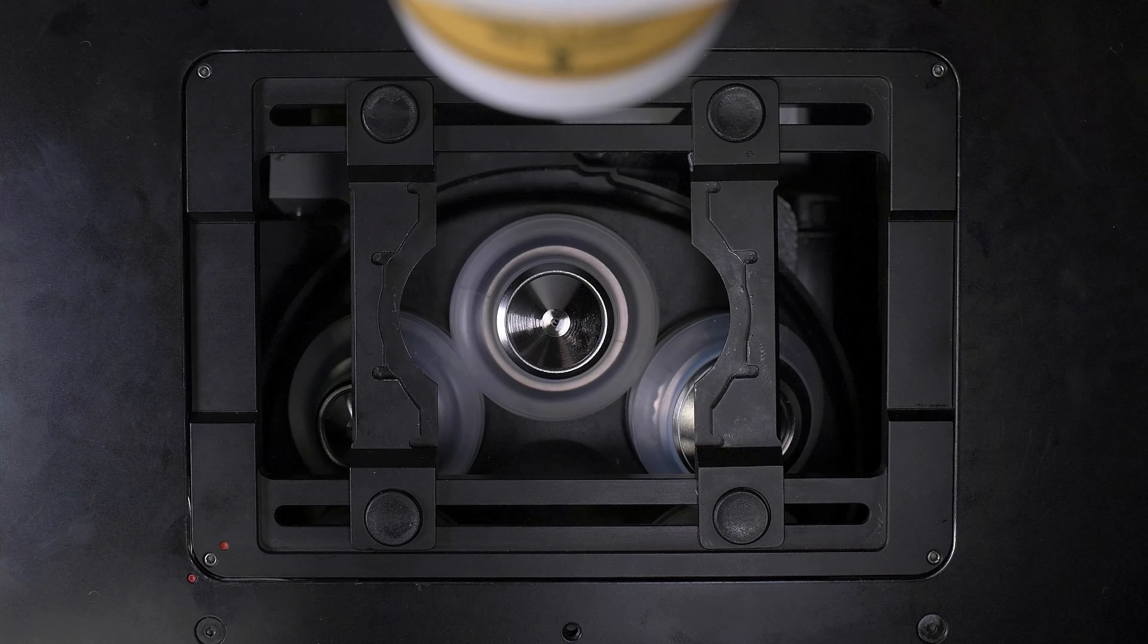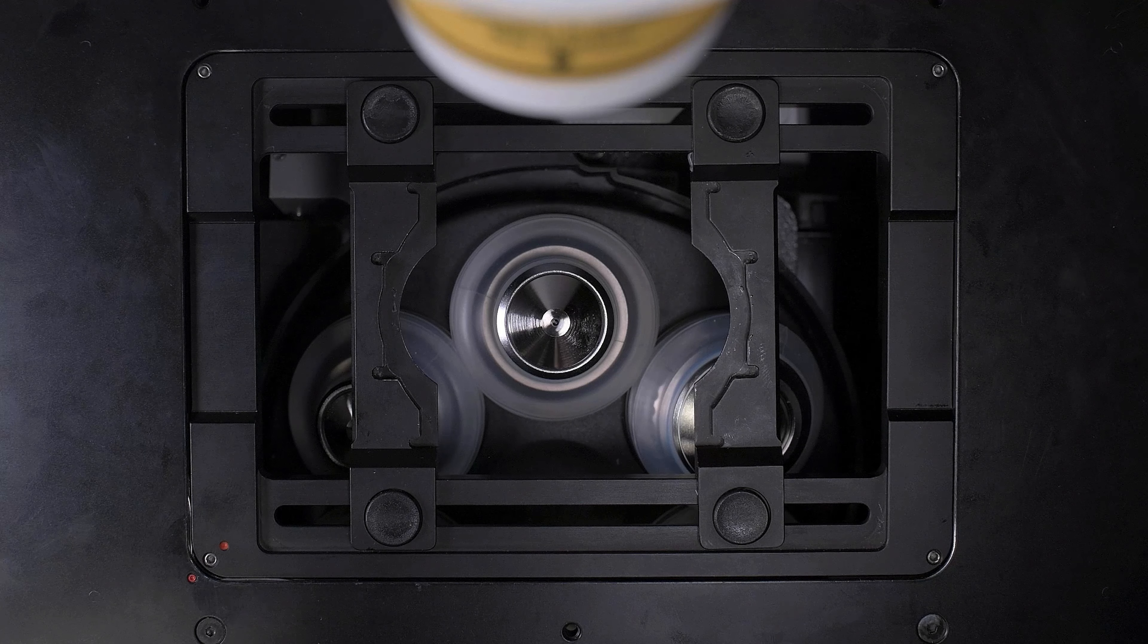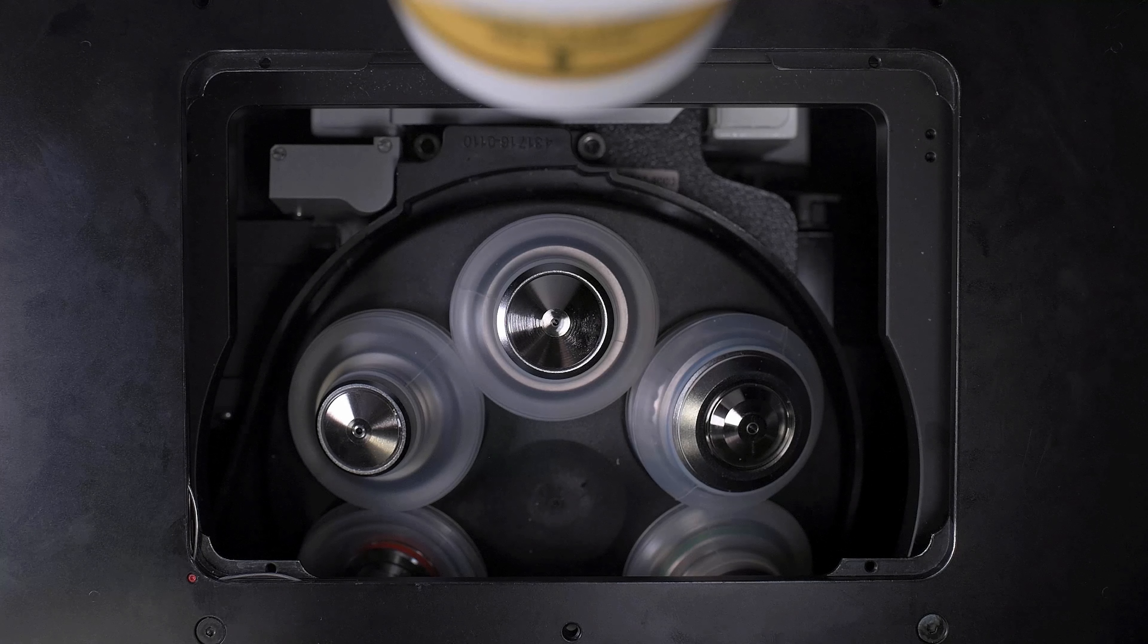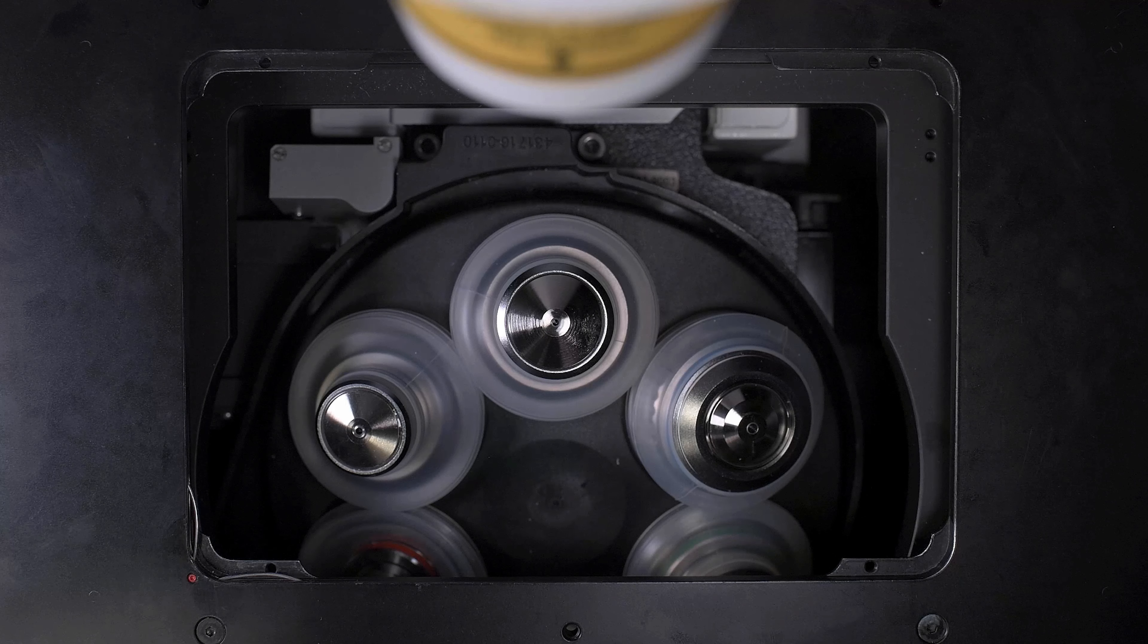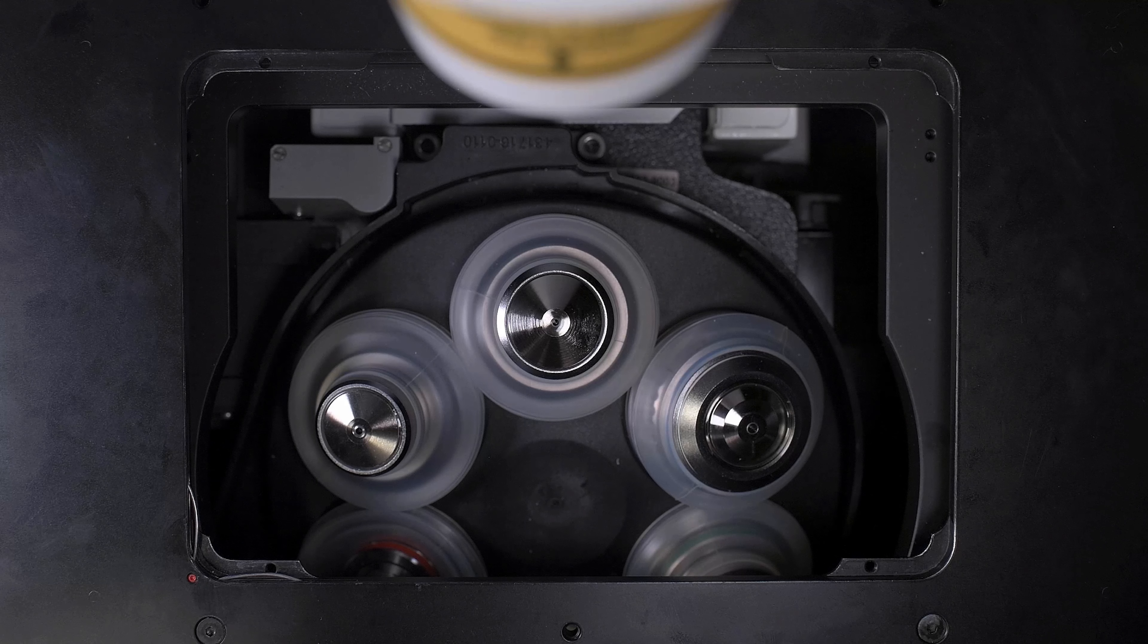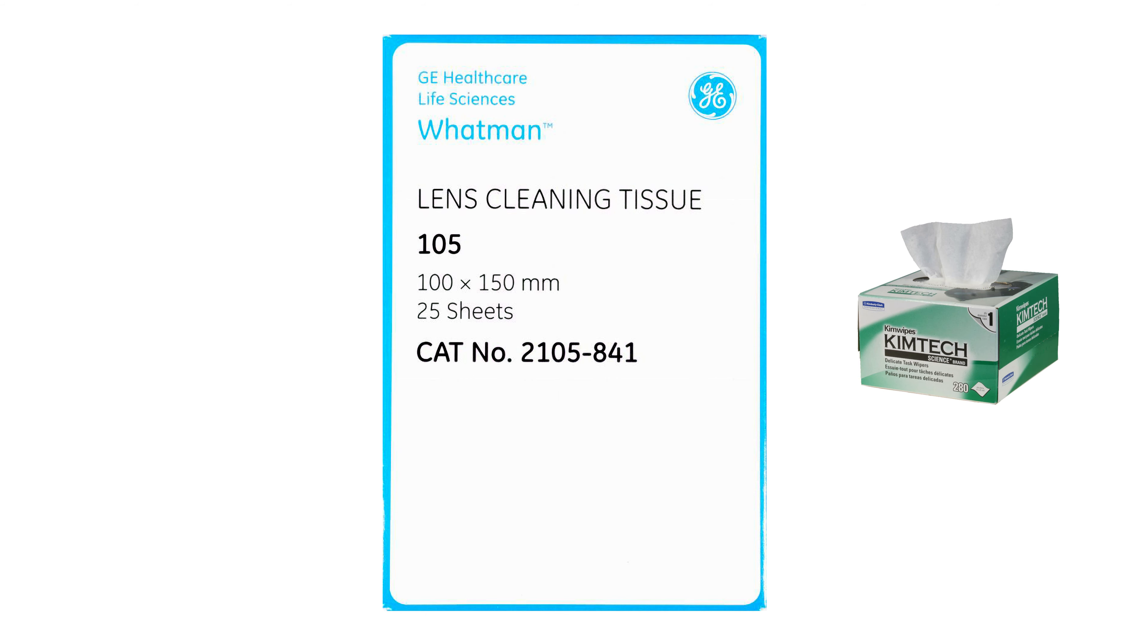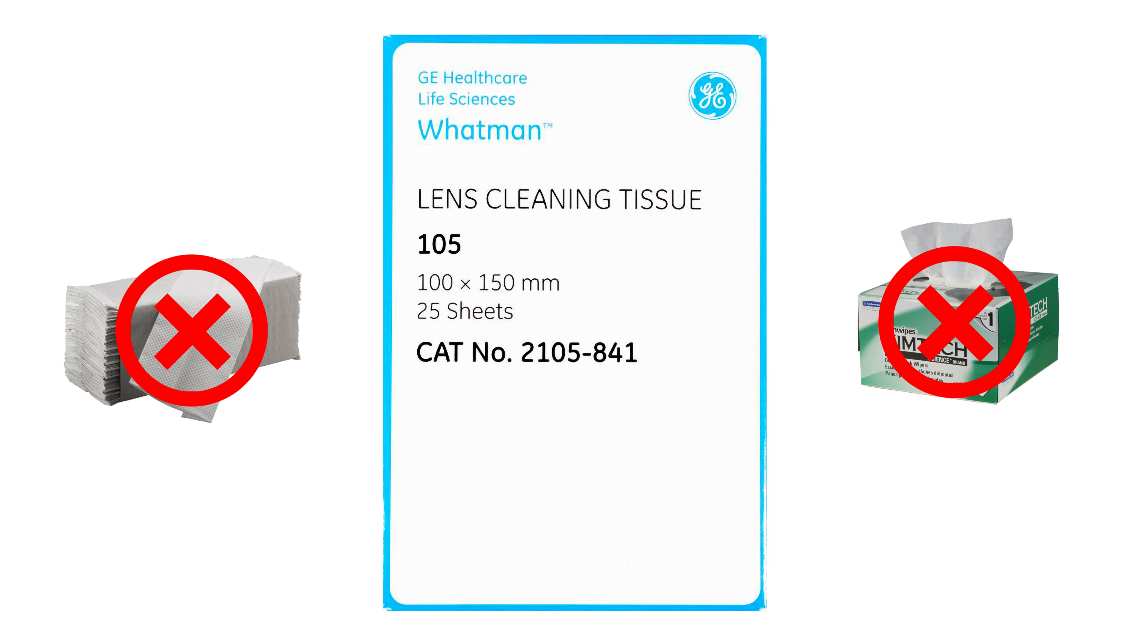When your imaging session is done, we'll need to ensure that we remove any residual oil from the objective. We don't want you to clean the lenses. Core staff will do that for you. However, we do expect you to wipe up any excess immersion fluid that remains on the objective. To wipe up excess immersion fluid, tear off a piece of Wattman lens paper. Do not attempt to use kim wipes, paper towels, or anything other than the provided Wattman lens tissue to clean excess oil.